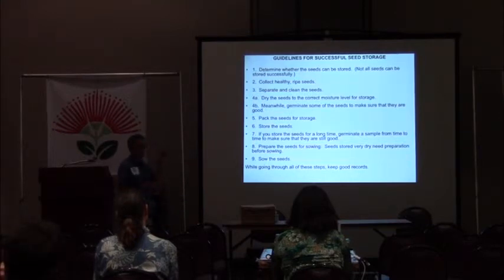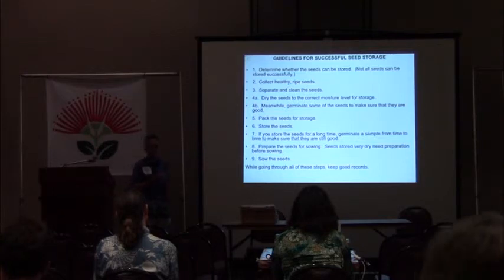If you store the seeds for a long time, that's to say more than a few years, you should take some out and germinate them. And when you do germinate them, there are some special techniques for germinating seeds that have been stored this way. You don't just sow them and then sprinkle water on them. That's explained in some detail in the handout.